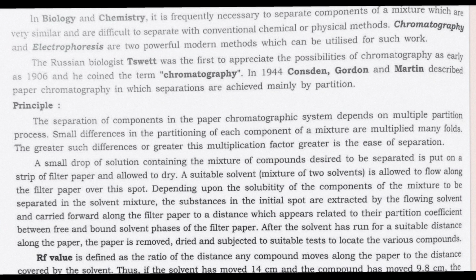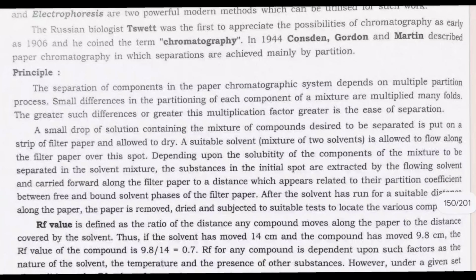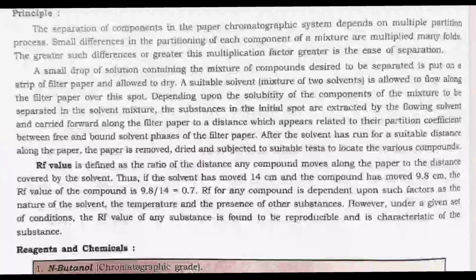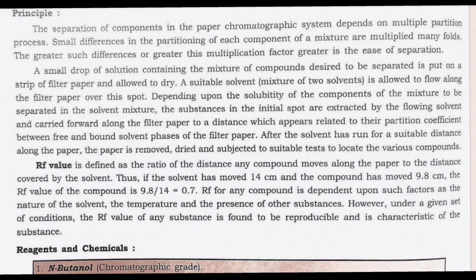Small differences in the partitioning of each component of a mixture are multiplied many folds. The greater such difference or greater this multiplication factor, greater is the ease of separation. A small drop of solution containing the mixture of compounds desired to be separated is put on a strip of filter paper and allowed to dry.